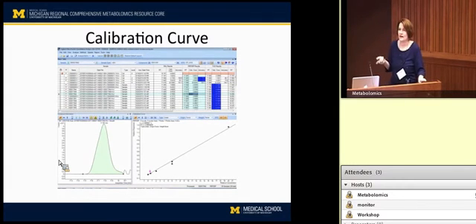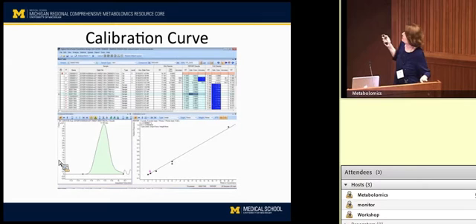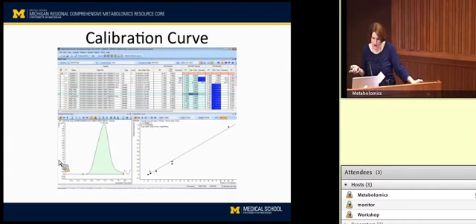But on the odd occasion that you were to say, oh, there's not going to be anything up there, something will show up there. Everybody's sample conditions are slightly different, and you may have a very elevated level of some compound that we don't normally see. So we keep that option open, but a lot of times the samples fall in this lower point, which is why there's more points down there on the curve. So I think I've covered most of what's going on there.